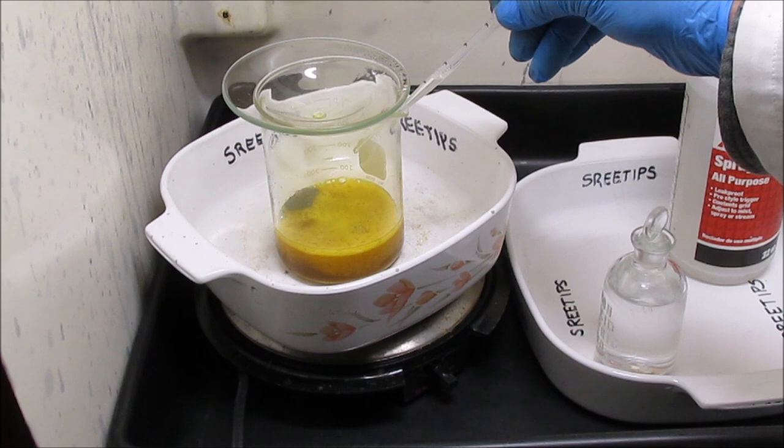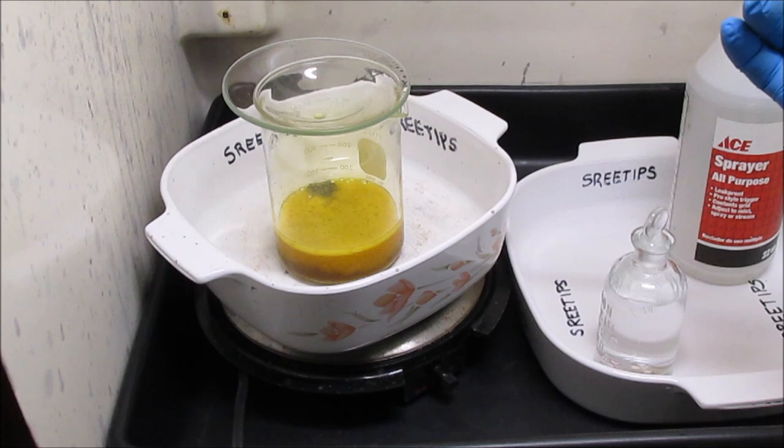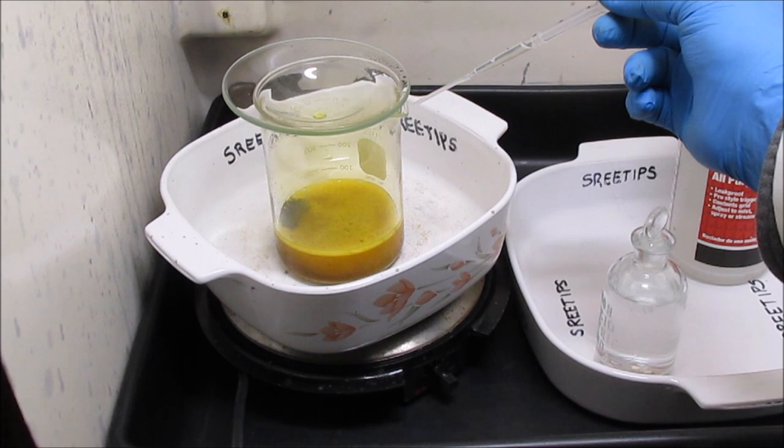Starts foaming up real good like that, I quit adding the acid. Let it have a chance to react, and then when it calms down, go back in and add a few more drops of nitric acid.